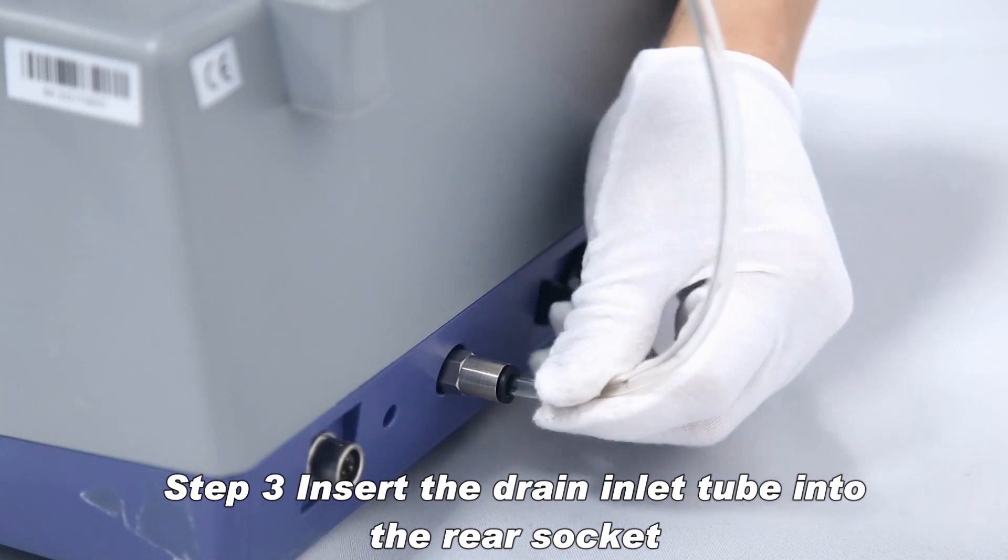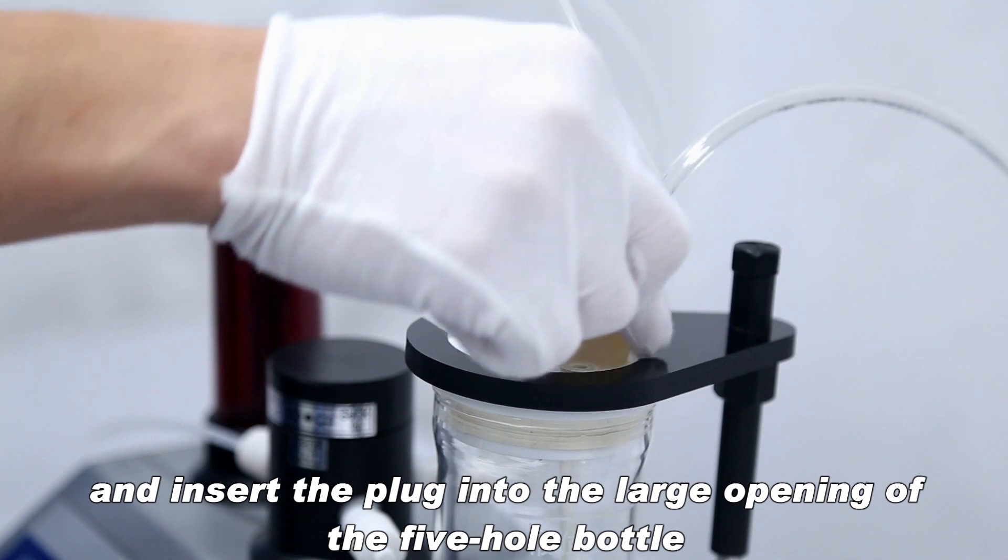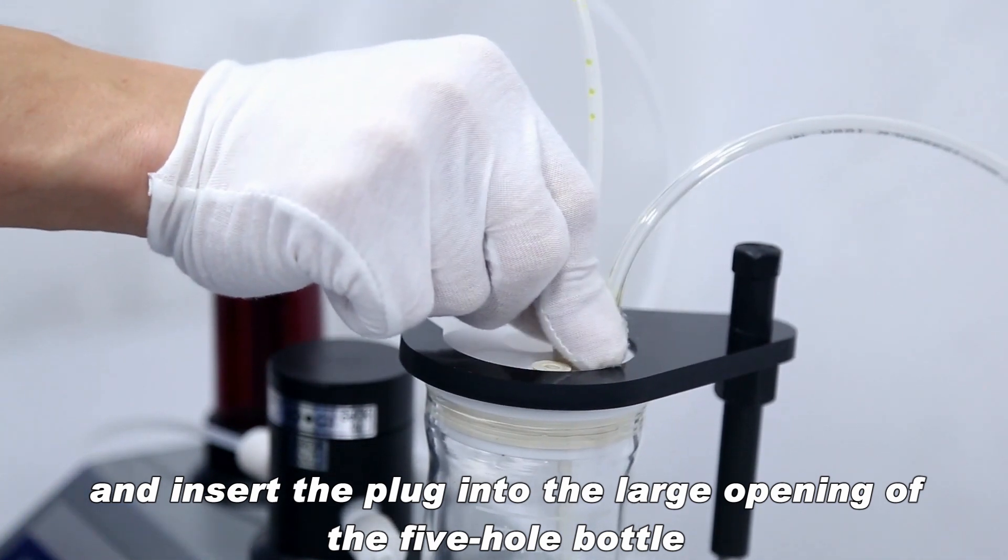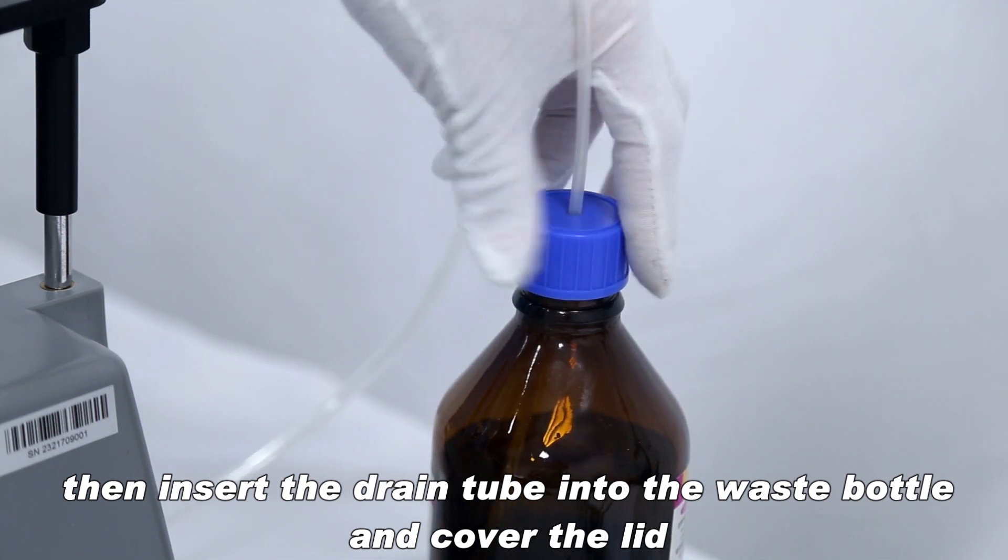Insert the drain inlet tube into the rear socket and insert the plug into the large opening of the 5-hole bottle. Then insert the drain tube into the waste bottle and cover the lid.